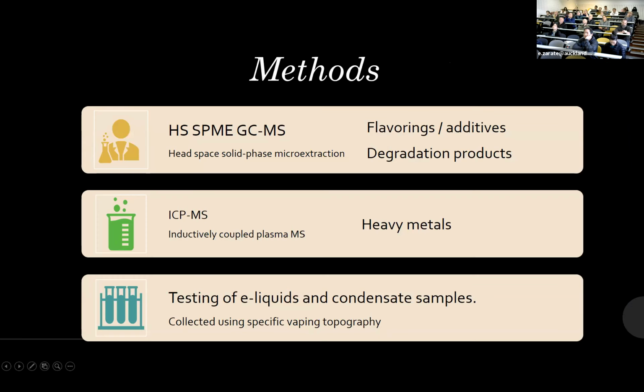So the methods that we are using in Angela's work so far are headspace SPME. In some preliminary work, we tested TDU-GCMS and liquid injection GCMS, and we found that we saw the greatest number of chemical compounds using SPME. So we're moving forward using this method.